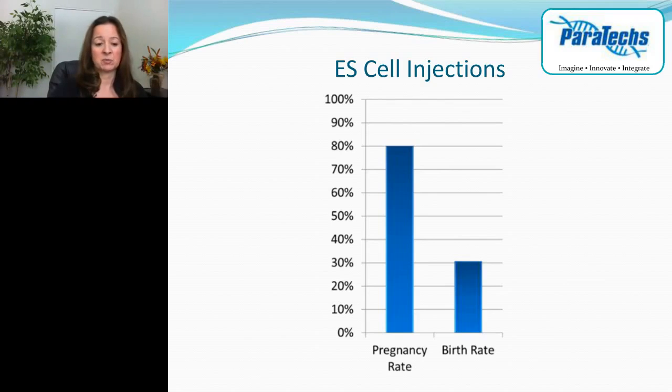In this experiment, the pregnancy rate from NSET transfers of ES cell injected blastocysts was 80%. The birth rate was 31%, and the total rate of chimerism, the number of chimeras per the number of pups surviving to weaning, was 54%.